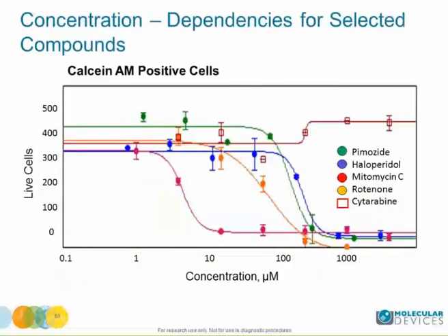Spheroid diameter or volume or the number of dead cells has significantly changed as a result of compound treatment, but usually did not follow a parametric concentration response. In contrast, the number of live cells as well as the volume of live cells or calcein intensity had a great assay window and also a good fit into 4 parametric concentration response curves.